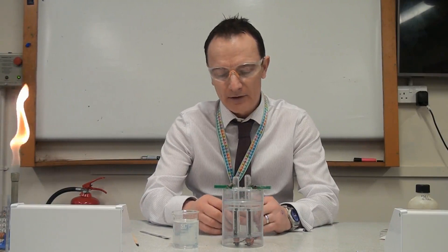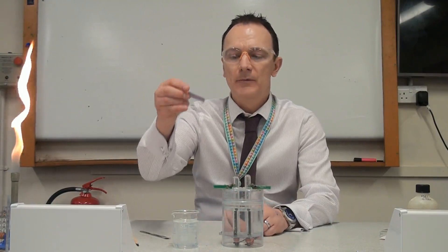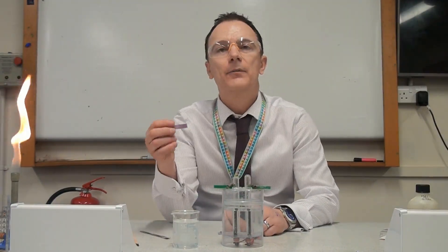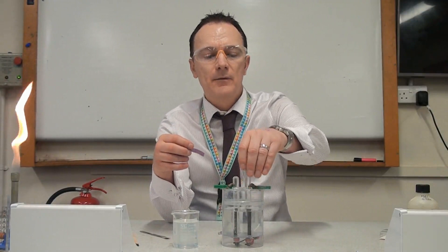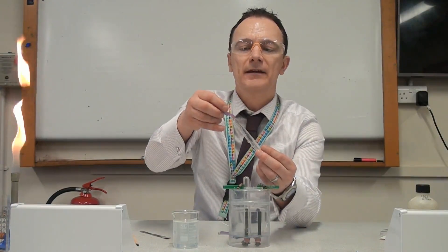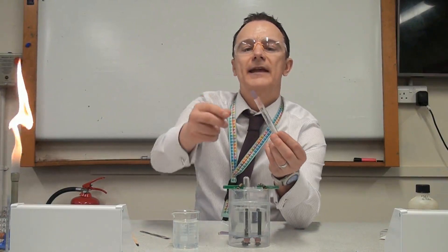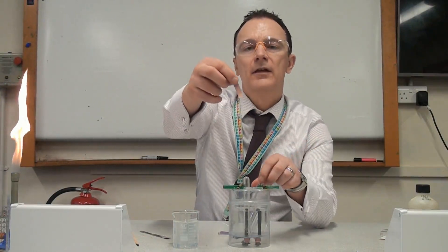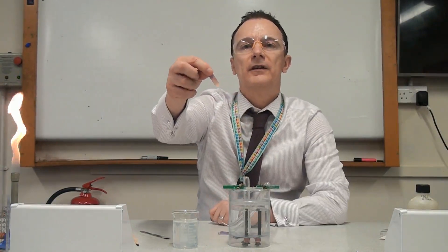To test for chlorine gas we use blue litmus paper. The first thing we do is make it damp by putting it in some water or running it under the tap. When we put it in the mouth of the open test tube containing chlorine gas, the chlorine gas bleaches the blue litmus paper — we can see this half has lost its colour.